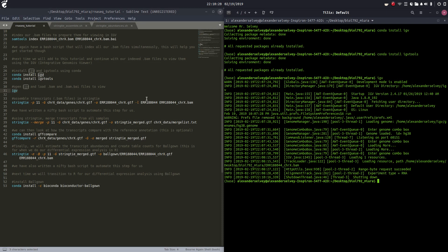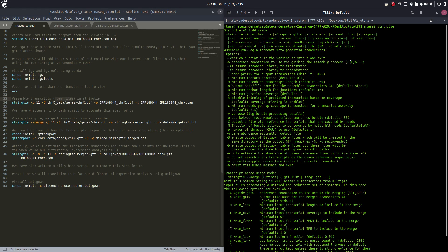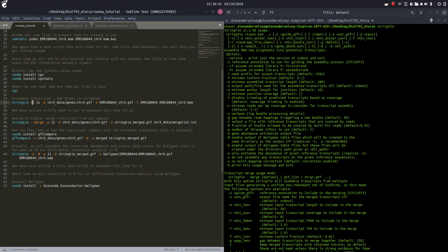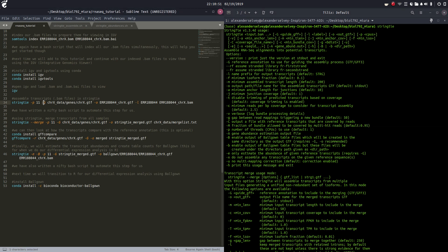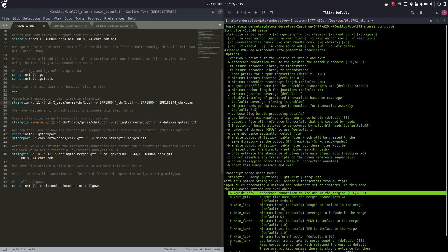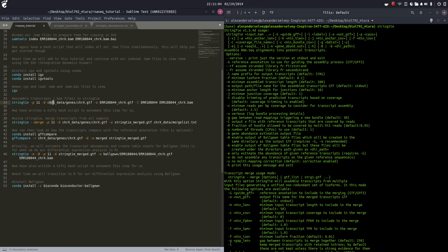We're going to exit out of this now and move to assembling our transcripts. Our BAM files - we're going to take all those individual reads and assemble them into long reads. I have opened the StringTie manual right here. Let's go over what these mean: dash-p is the number of threads to use - I'm using 11. Dash-G is the input for the guide GFF, which is the reference annotation to include in merging. This is our guide GTF, located in chrX_data/genes/chrX.gtf.